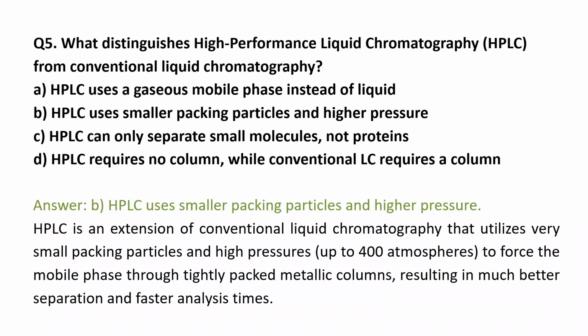This results in better separation efficiency and faster analysis time. Here it uses higher pressures, up to 400 atmospheres, to force the mobile phase through tightly packed metallic columns. That's the difference. Cool.